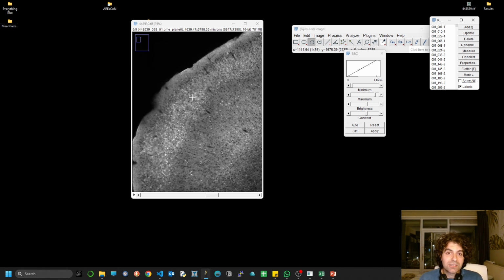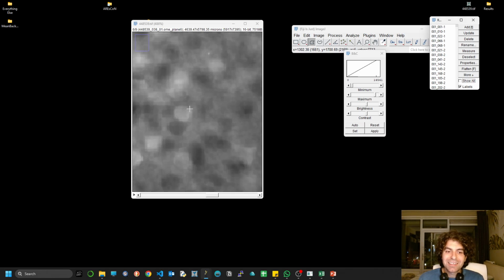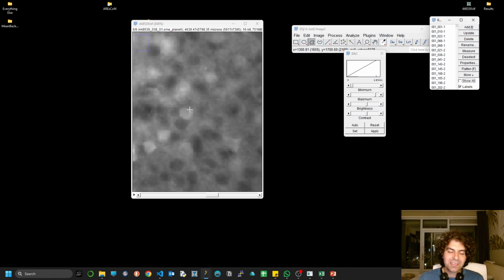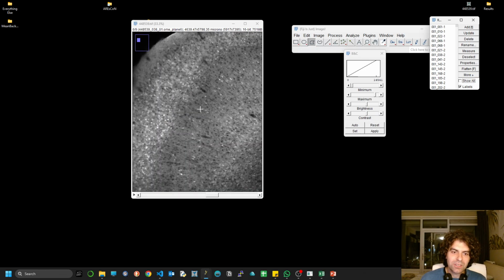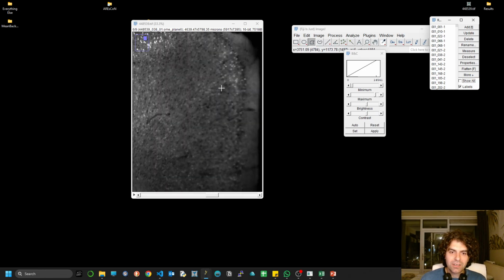So it is utilizing predictions from AResCoN. It's not really a 3D prediction. I tried a bit to use the 3D prediction from different pipelines. It didn't really work, and it makes sense because you don't have a complete 3D image here. You just have slightly different depths, which are related many times not to a depth of the neuron, but to a depth due to the wiggly nature of the tissue.